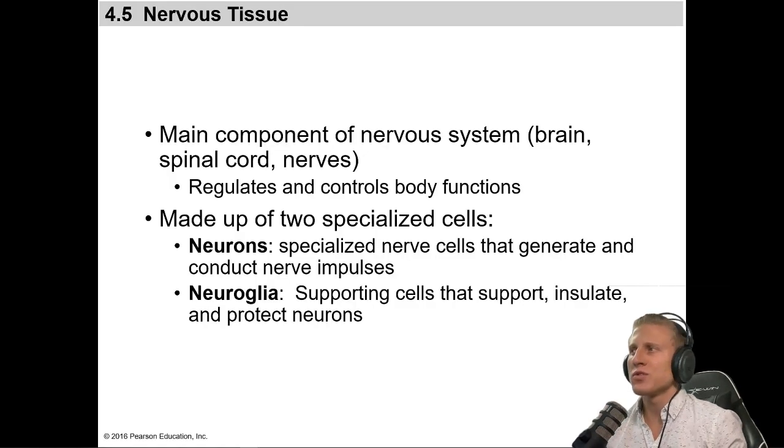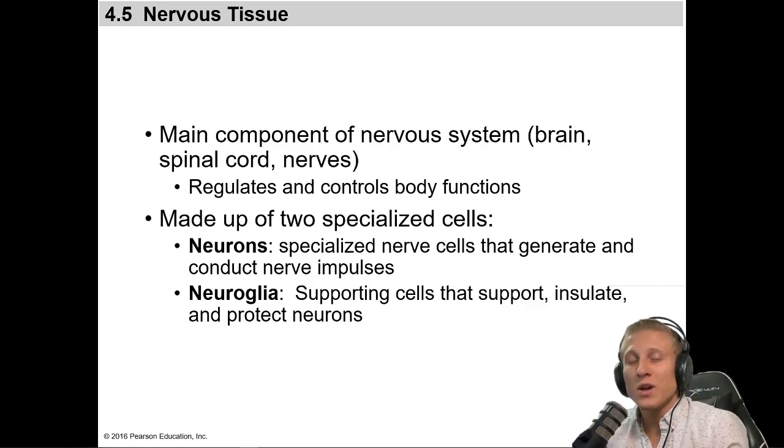Lastly, we have nervous tissue. This will be fairly quick, not a whole lot to discuss here. We'll cover this more in depth when we cover the central nervous system in class. We can broadly categorize nervous cells into two categories. We have neurons, which is what you think of when you think of a neural cell. These are the ones that are actually carrying out action potentials, the process of communication.